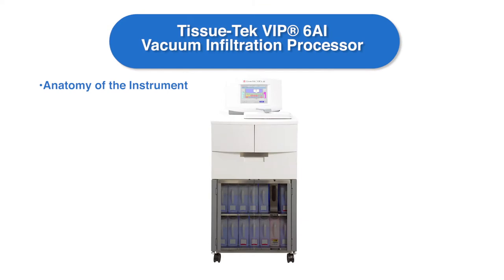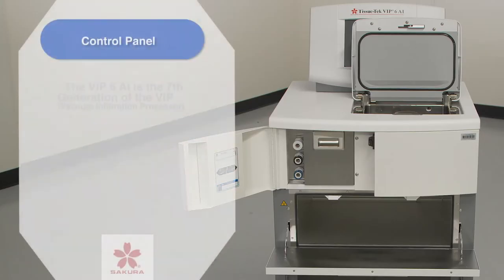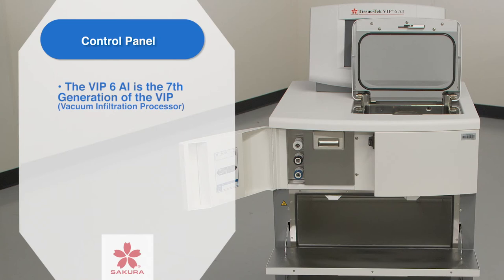The objective of this training film is to provide users with all aspects of VIP 6AI operator interface. Please note that any programs contained within this film are for training purposes only and not to be used for patient tissue processing. The VIP 6AI is the 7th generation of the VIP vacuum infiltration processor.